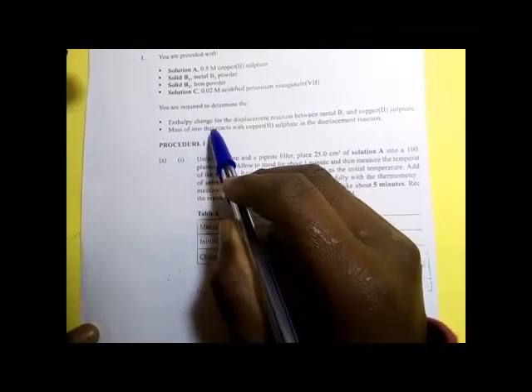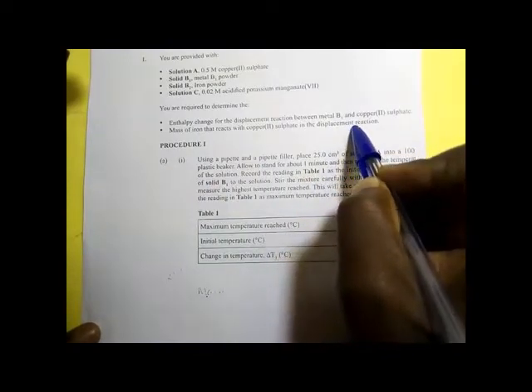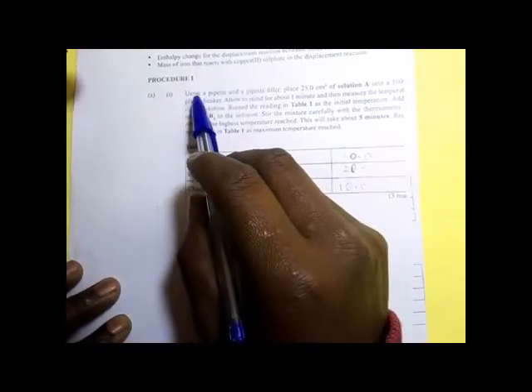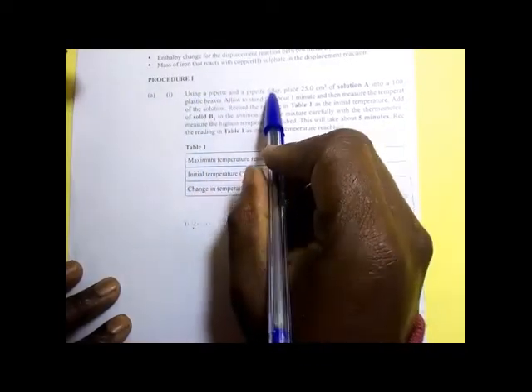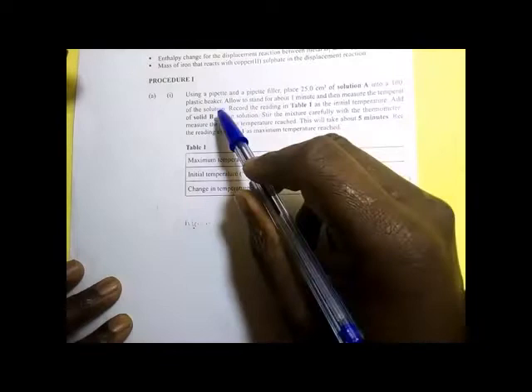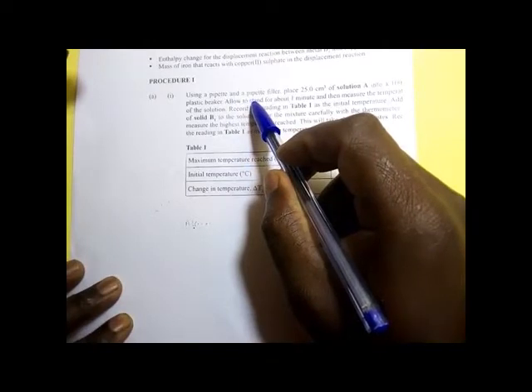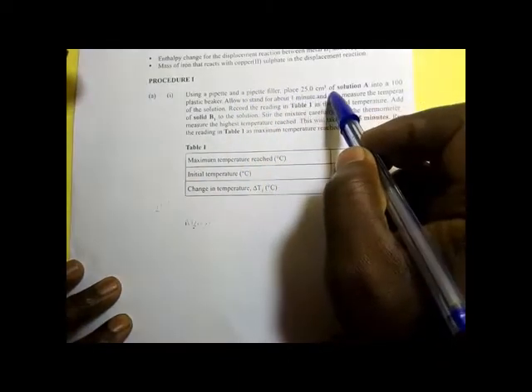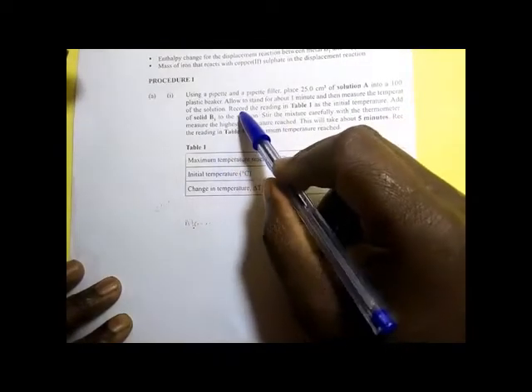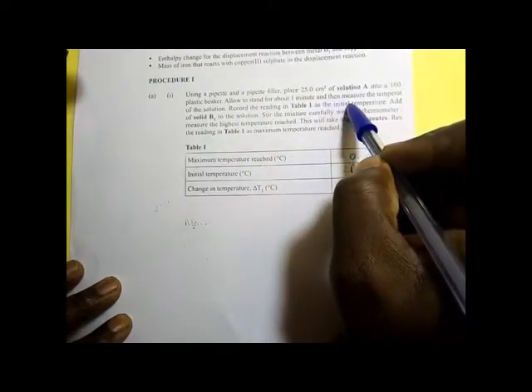Mass of iron that reacts with copper(II) sulfate in the displacement reaction. Procedure. Using a pipette and a pipette filler, place 25 cm³ of solution A into a 100 cm³ plastic beaker. Allow to stand for about 1 minute, and then measure the temperature of the solution. Record the reading in table 1 as the initial temperature.